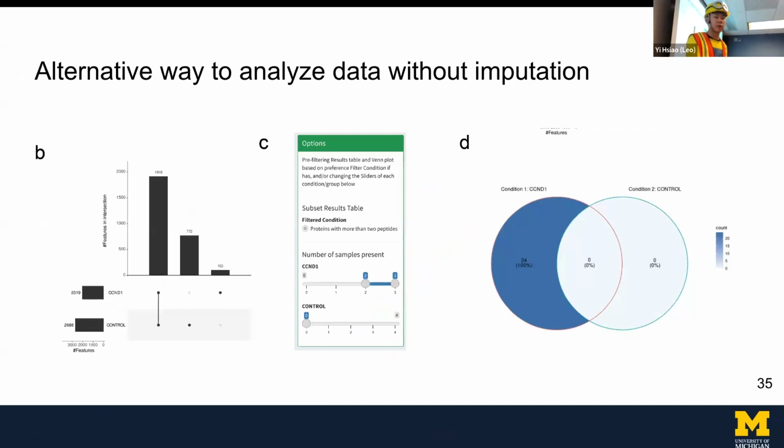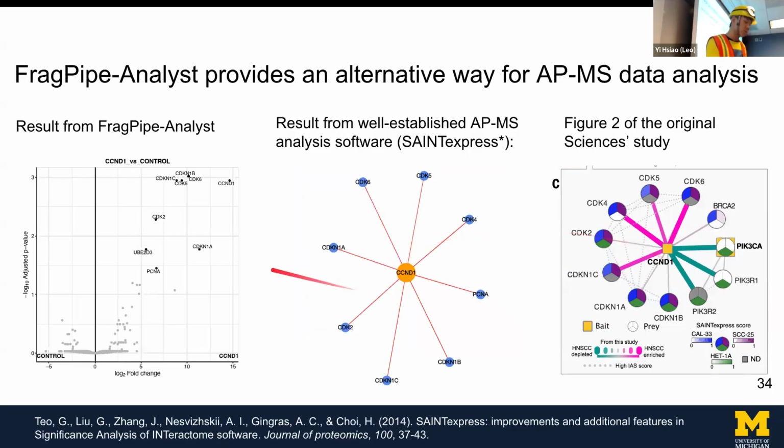One consideration when you use this AP-MS protocol is that it is usually label-free, so there are many more missing values. In the volcano plot shown here, we use imputed data, but some people feel it's not safe. I would also say you need to investigate a little to see that your imputation doesn't influence your conclusion on the data.